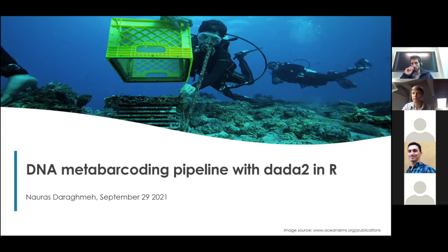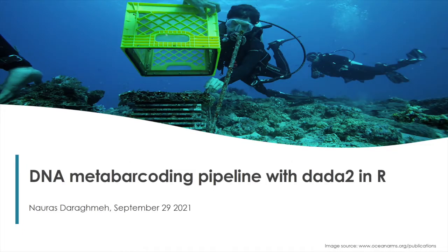I'm just going to go a little bit into the DNA metabarcoding workflow with dada2 and R, which is a tool that is widely used for sequence analysis. I'm going to give some general introduction, and then I have prepared a script which I'm going to run live, so you can see all the output and all the steps.